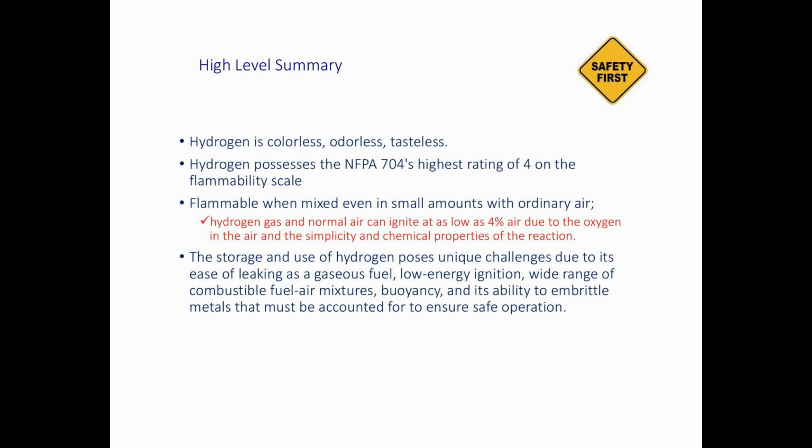The storage and the use of hydrogen pose a unique challenge due to its ease of leaking as a gas. Sometimes it's hard to trace the minor leaks. You need to pay extra attention to all the leaks when you work with hydrogen. So you never let it run overnight unattended. It will generate impurities for the hydrogen. It also has a buoyancy effect and an ability to embrittle metals.